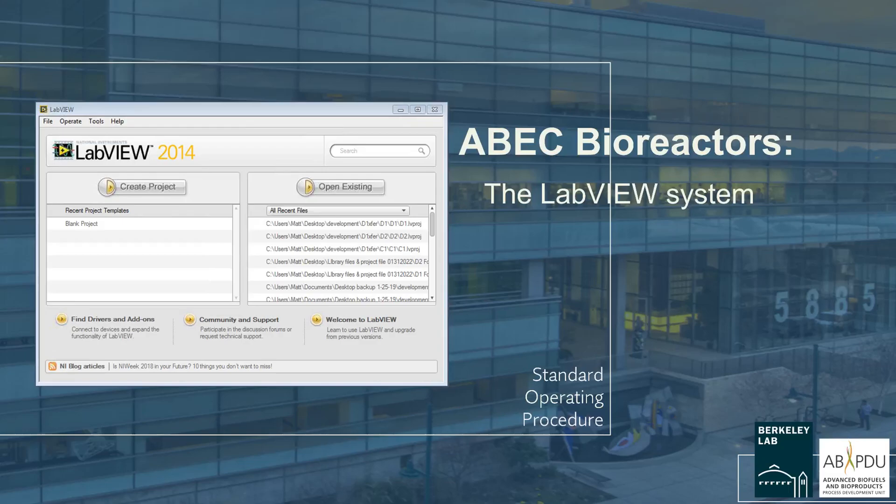This video SOP demonstrates how to set up the LabVIEW system. To set up LabVIEW, the operator will need to perform a series of tasks involving hardware, software, and networking configurations.